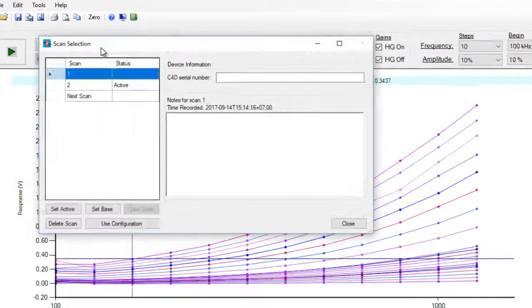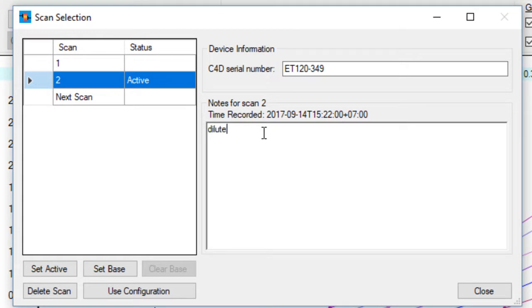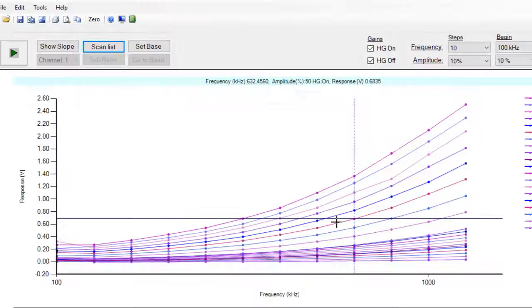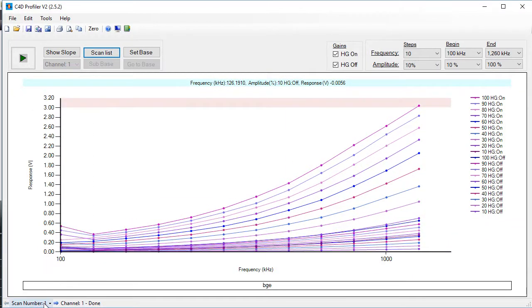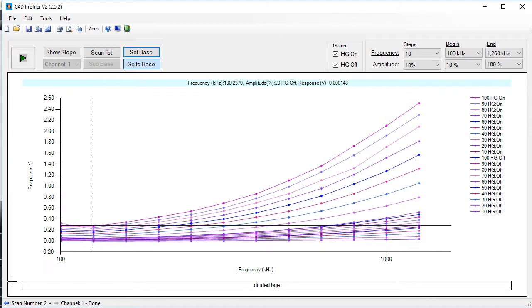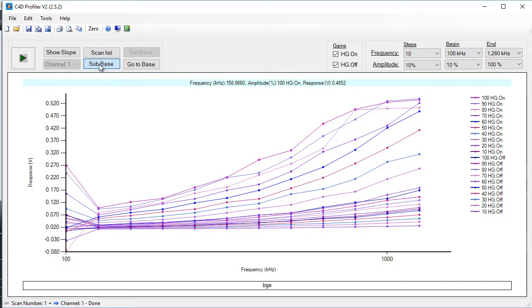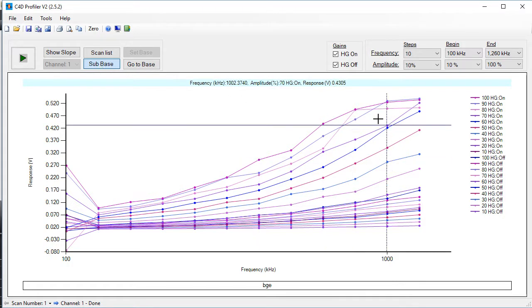We should now go to the scan list. We can enter the serial number of the C4D head stage in here and keep notes down here. So scan number one is the background electrolyte, and number two is the diluted background electrolyte. Now we need to take the diluted background electrolyte — that's scan number two — and set this as the base. If we go to number one, we can subtract the base from our background electrolyte. What we're getting is the difference between the background electrolyte and the diluted background electrolyte, and what we're looking for is the highest point — the highest difference between those two.